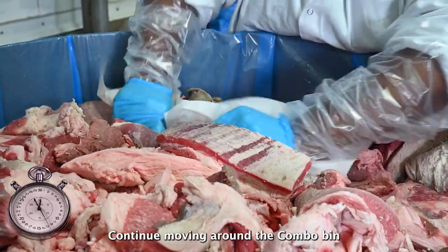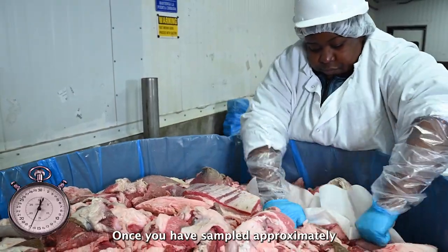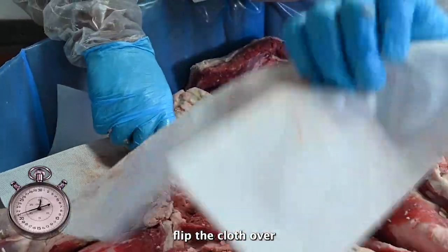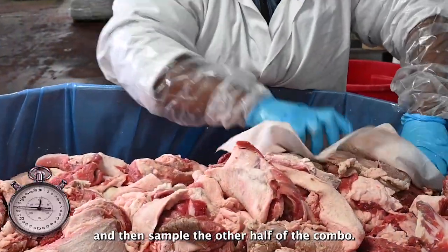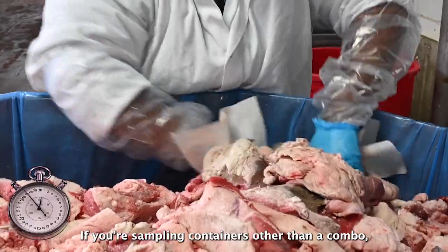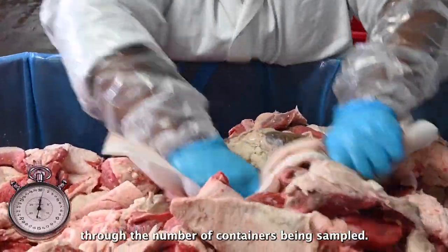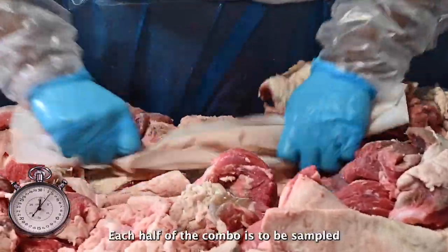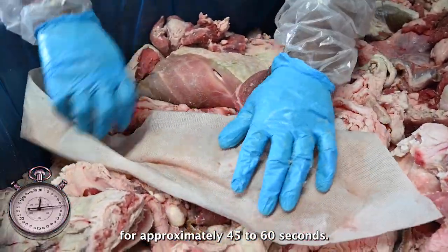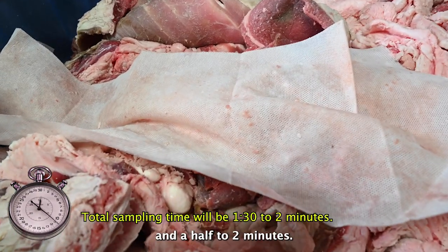Continue moving around the combo bin as you vigorously massage the meat. Once you have sampled approximately one half of the combo, flip the cloth over and then sample the other half. If you are sampling containers other than a combo, flip the cloth over approximately halfway through the number of containers being sampled. Each half of the combo is to be sampled for approximately 45 to 60 seconds. The total sampling time per lot will be around one and a half to two minutes.